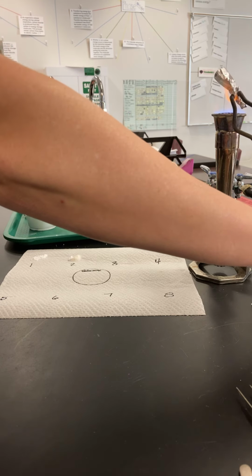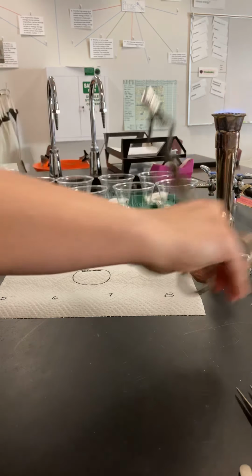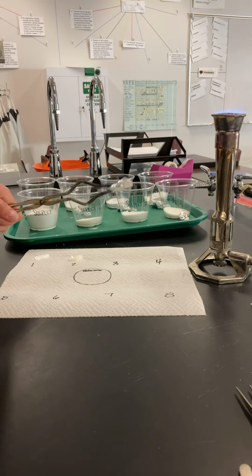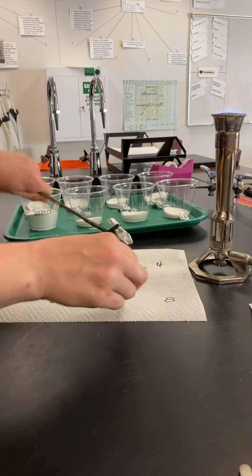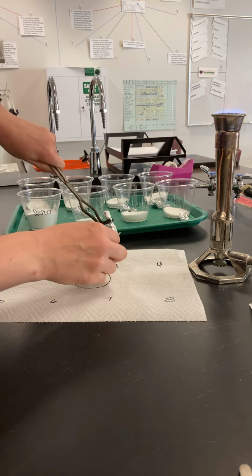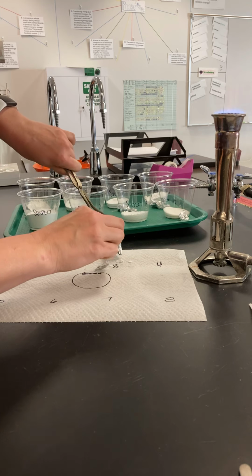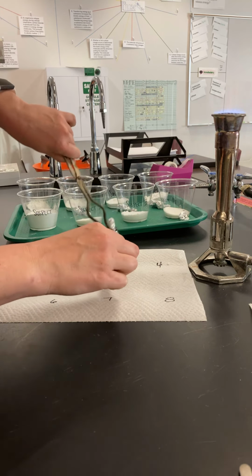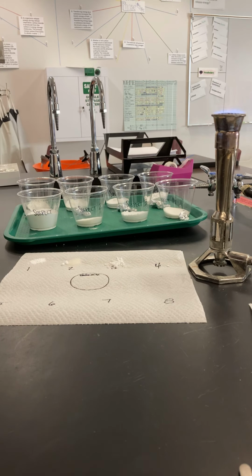1, 2, 3, 4, 5. It almost looks like there was a little bit of melting to the point where this was clumped up. I'm going to go ahead and try to open this up a little bit better. It started to want to melt, so you could maybe even put this as a medium boiling point or melting point. Where it melted, it clumped together. It was more of a powder, and now there's just a lot of chunks available to that one. So that was suspect or substance 3.